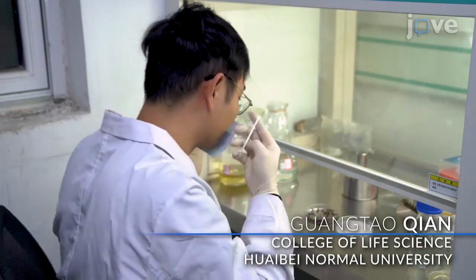Demonstrating the procedure will be Guang Tao Qian, a master student from my lab.